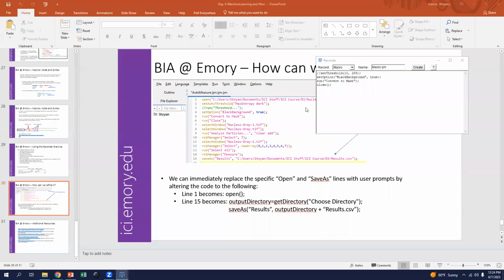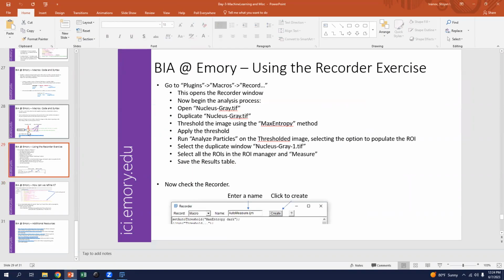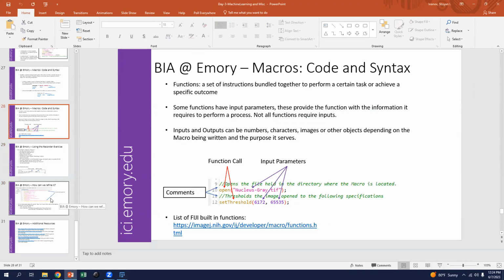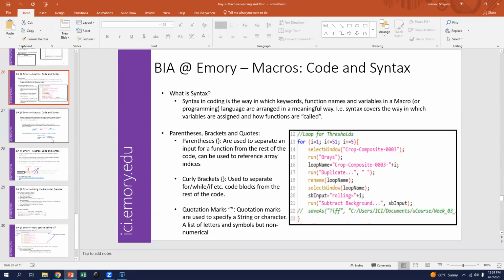The modified it, and gotten some kind of output. So I'm going to spend a few more minutes just talking about what a good way in which to write your macro is. Then we can take some questions in terms of applications and points of interest. And that will conclude the seminar.